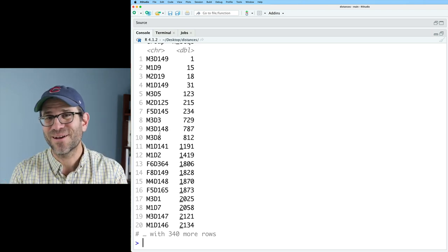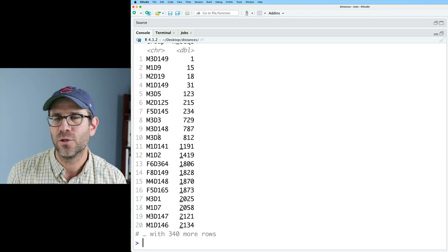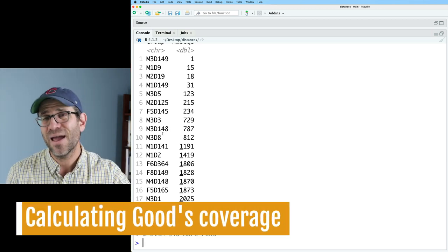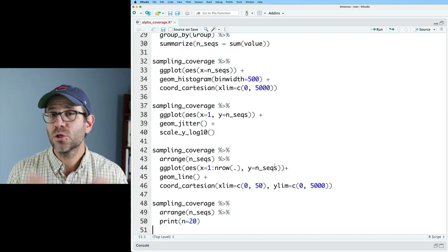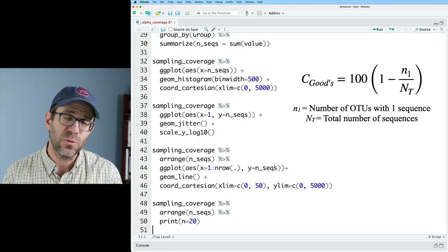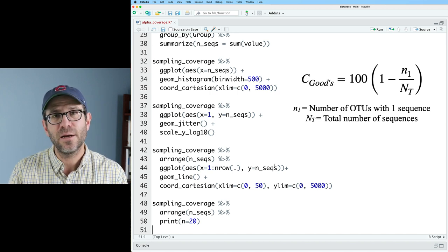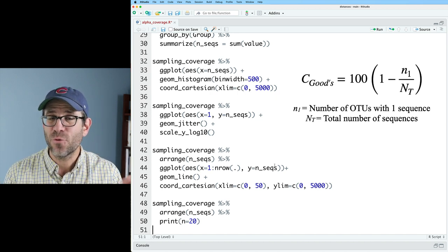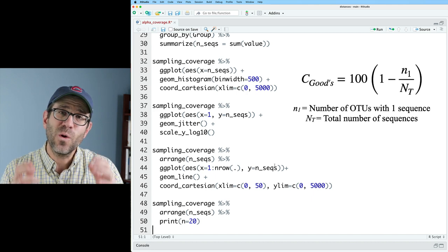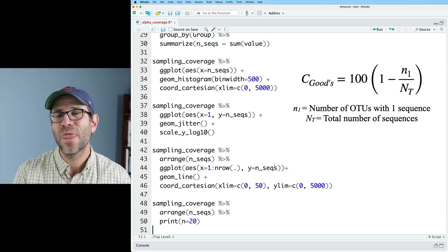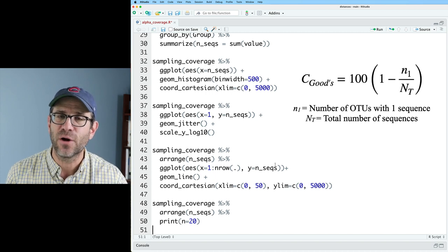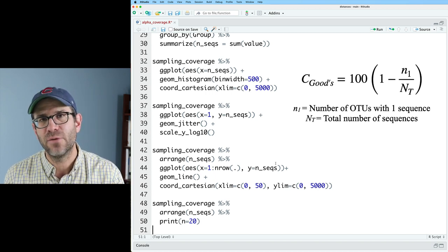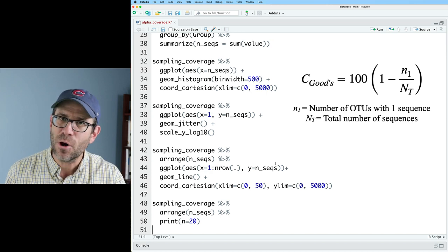Also, if the reviewers are giving you grief, there's one other metric that I'd like to share with you that you can give back to the reviewers to say, meh, I think we're okay. And that's goods coverage. So goods coverage is the fraction of sequences that appear in an OTU that has been seen more than once. I've got the formula here for you to look at. And one thing I would encourage you to do is pause the video and see if you can't take the shared data frame and calculate goods coverage for every sample in the data set.